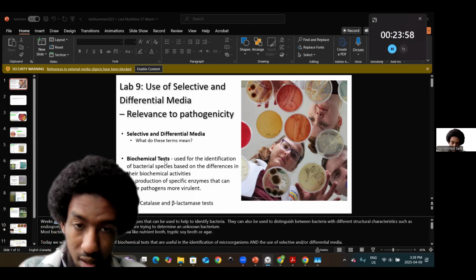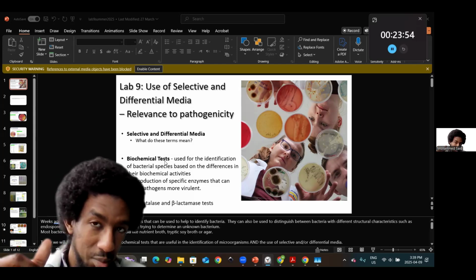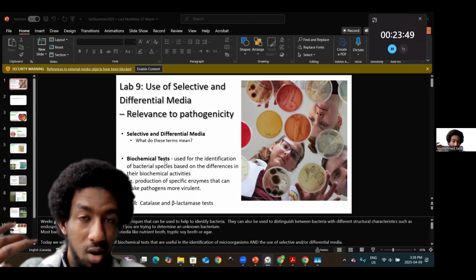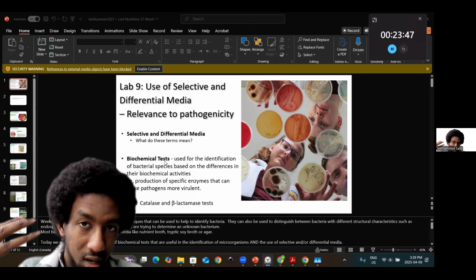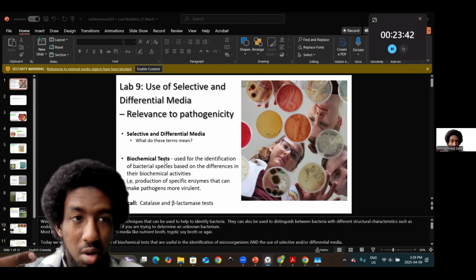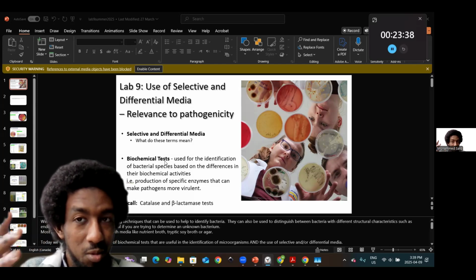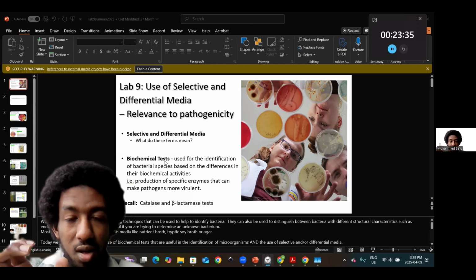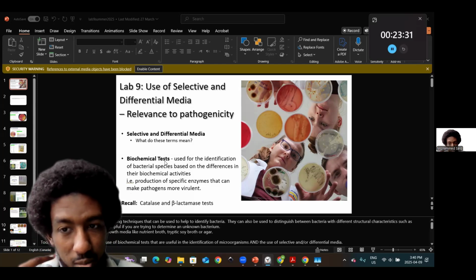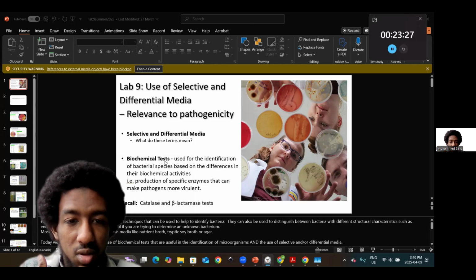That could be the enzymes that they have, or the different components that they have extracellularly. Remember the capsule stain, or intracellularly, the endospore stain. Or the gram stain in terms of the thickness of their peptidoglycan layer and the implications those all have with UV exposure or biofilm formation. So a lot of these details connect from our first set of review labs to our final set of review labs today. I hope you have been able to integrate these concepts uniquely, diversely, and sincerely for his sake.